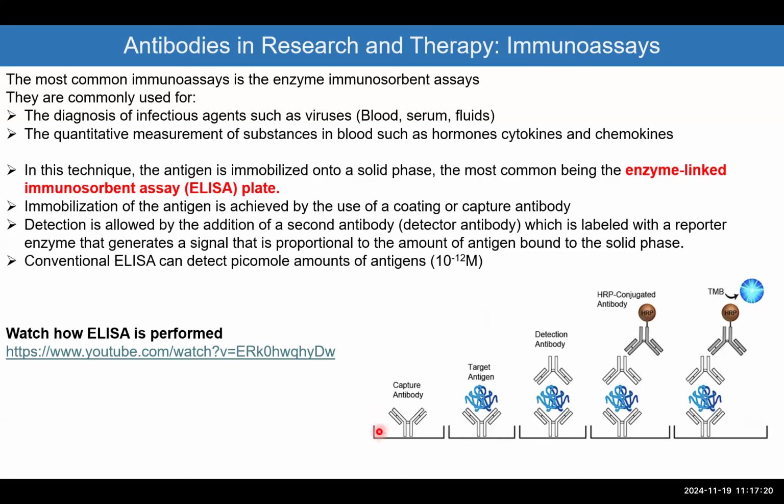these plates already have a specific antibody that is detecting that antigen, whatever that antigen is. Okay, it's represented here in blue. So this antibody detects that antigen.